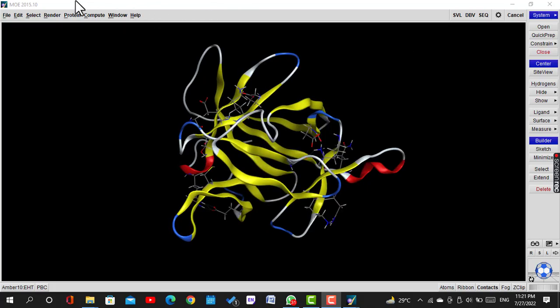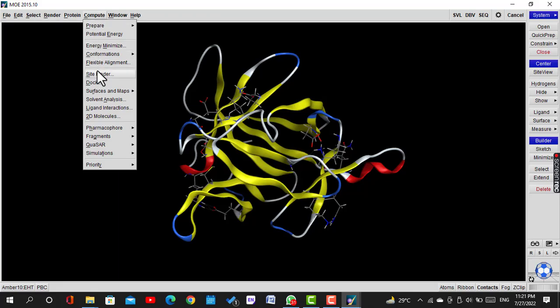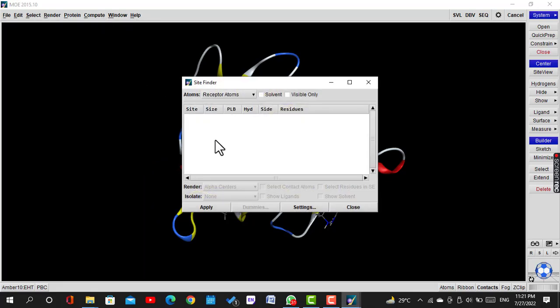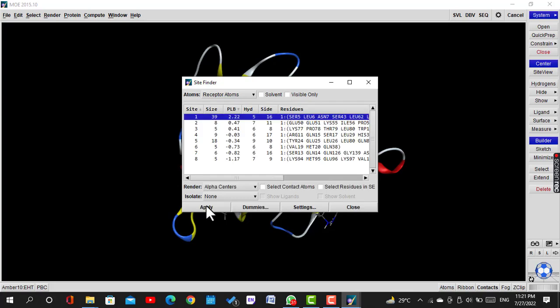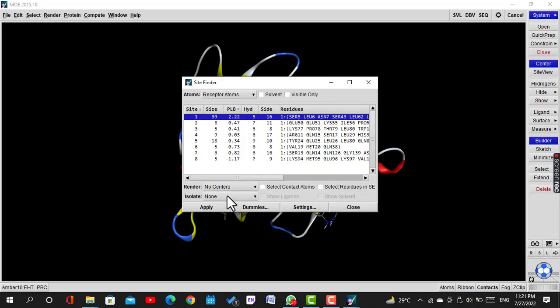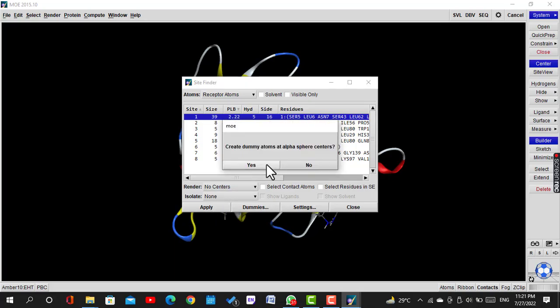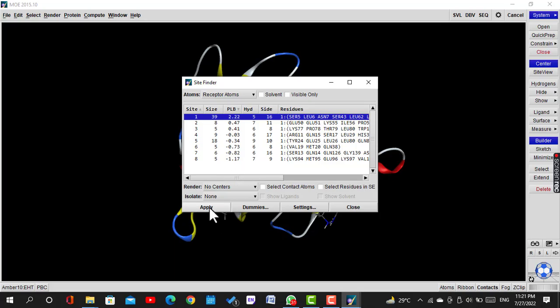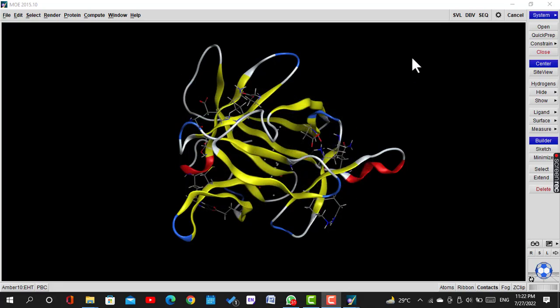Again click on Compute, Site Finder. A new window will be opened. Click on Apply. Another window will open. Select the active site which you want. Usually the top one having the highest number of amino acids is selected. Then click Select Close. Click Apply.